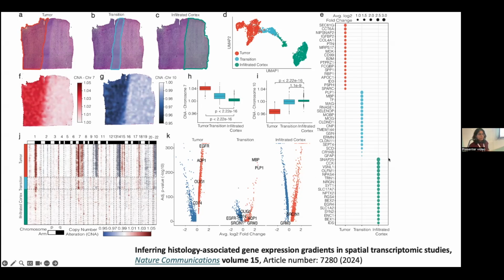So in this paper, what the authors specifically want to understand is the question of the gradient of gene expression patterns between, let's say, different histologically defined domains. So this was manually annotated. You don't need to have an unsupervised spatial clustering. You can have your own clusters that are predefined and annotated by you, and you can split your gene expression through that as well.